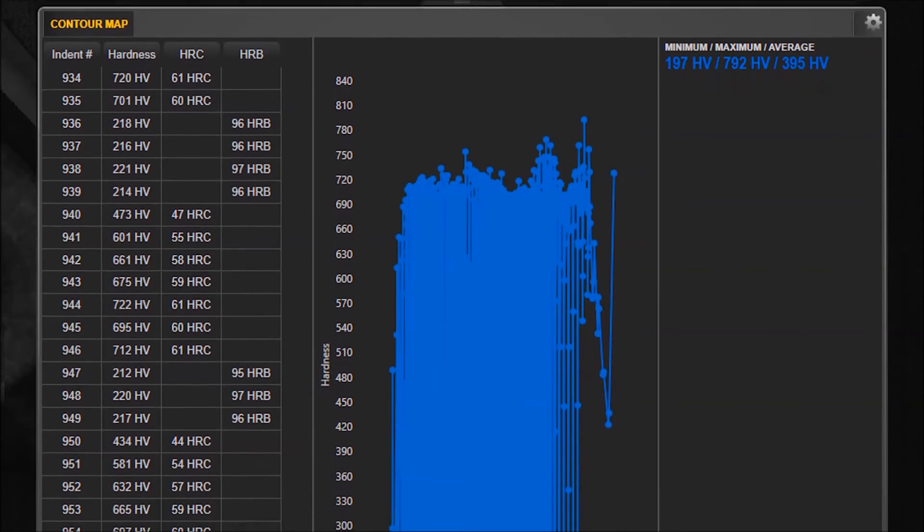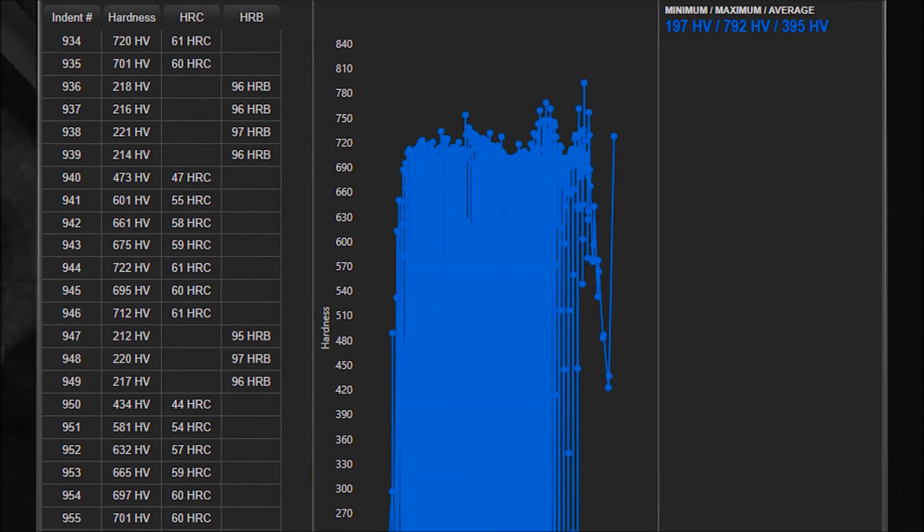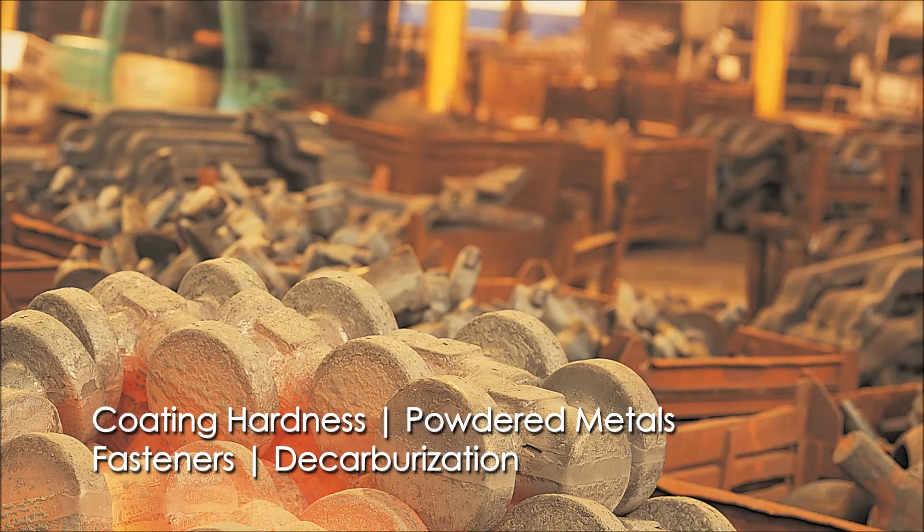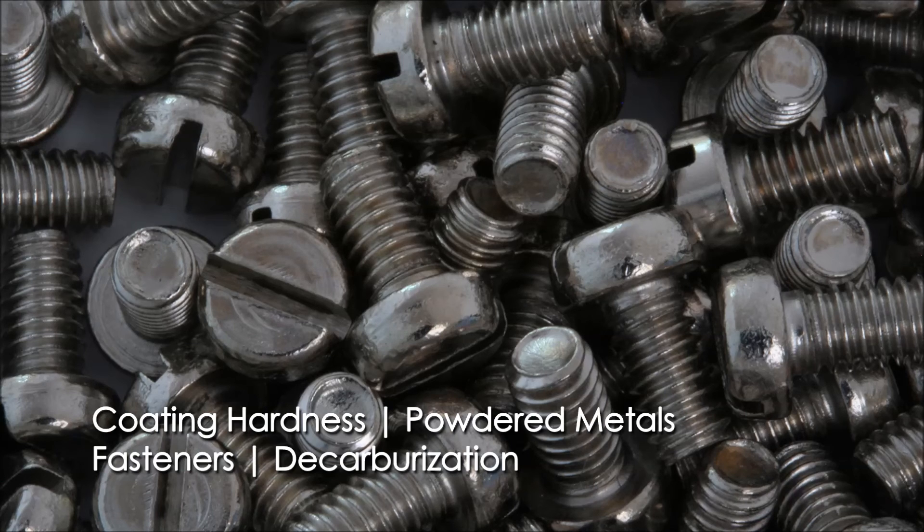This gives you the ideal tool for weld analysis. In addition to case depth analysis and color hardness mapping, the AMH-55 hardness testing system is ideal for coating hardness, powdered metals, fasteners, decarburization, and so much more.